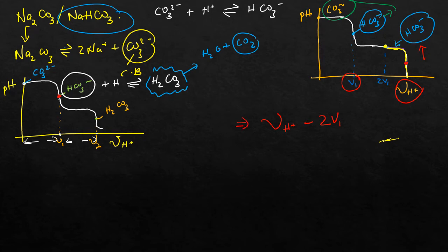This will give you the volume of acid that reacted with the bicarbonate in the mixture.